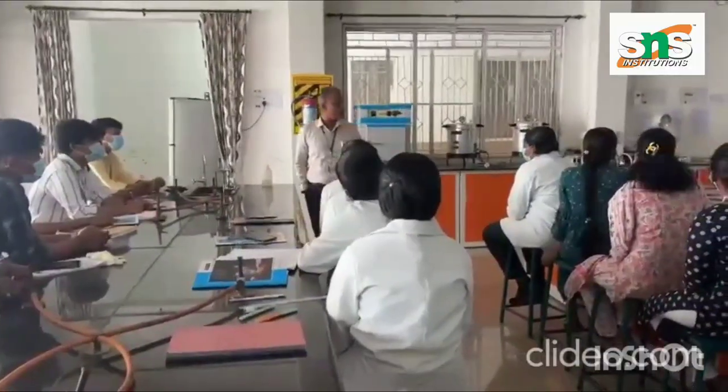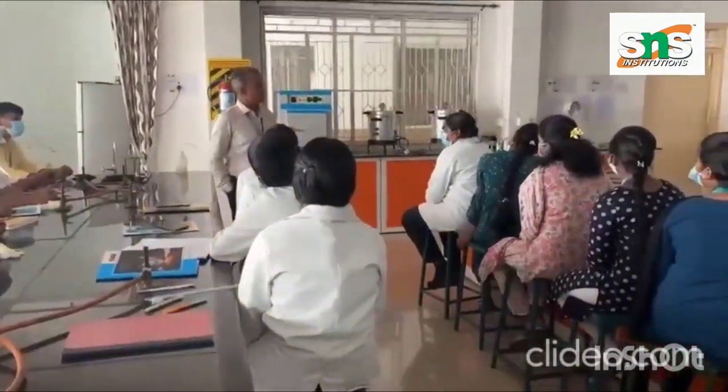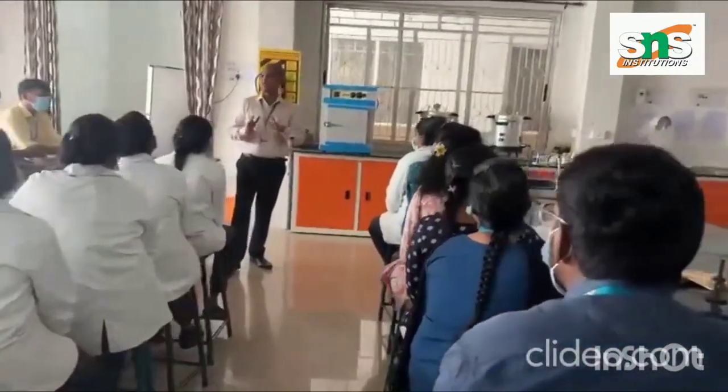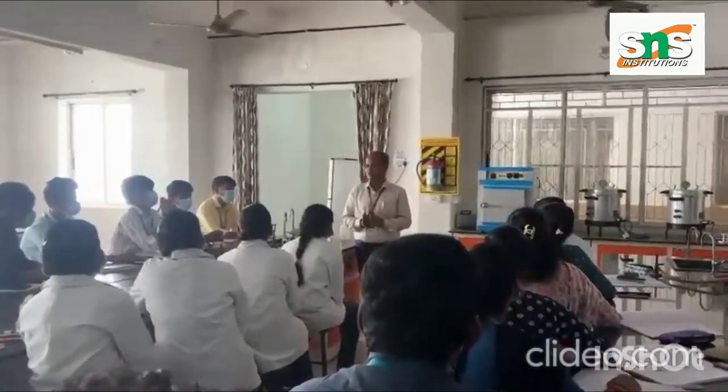But this is what we are going to perform. Once we identify the MPN number, then we will go for the E. coli confirmation. There are two sets of practicals, or two sets of combinations. So how do we understand?